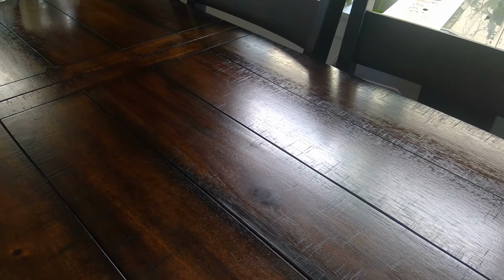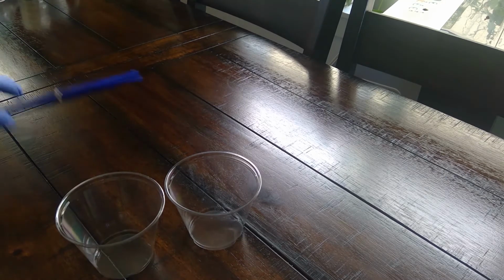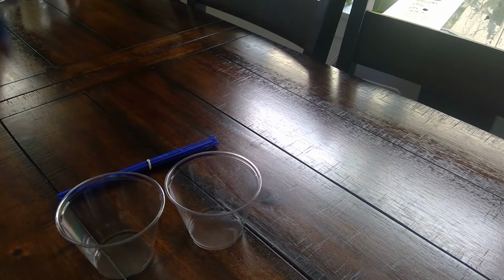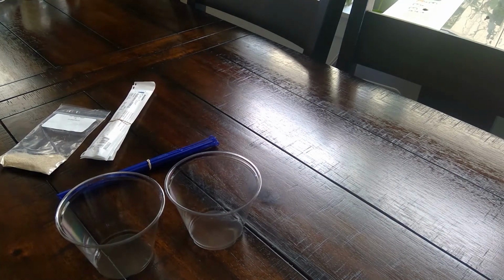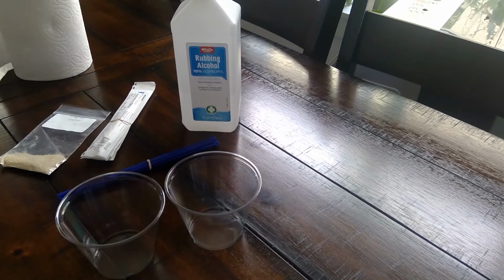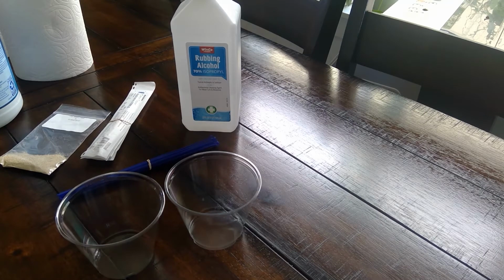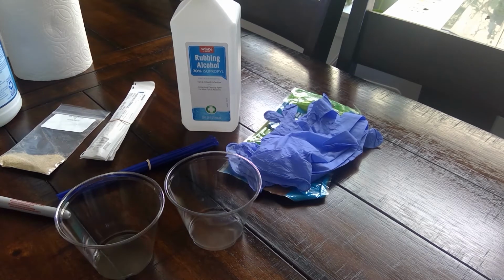So step 2, gather 2 inoculation loops, the sterile swab pack, and 2 disposable cups. There's 2 disposable cups. Here's my inoculation loops, the sterile swabs, and baker's yeast, alcohol, paper towels, bleach, your permanent marker, where did I put it? Oh, there. Your gloves, mask, apron, and goggles.